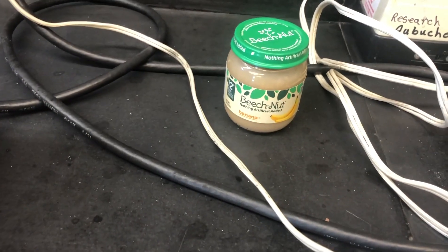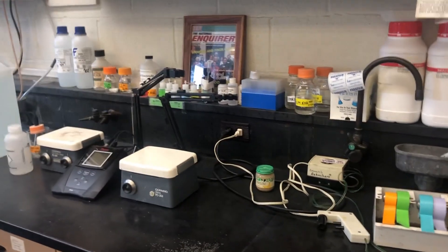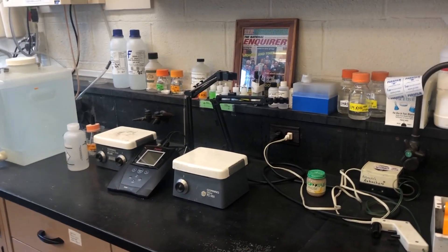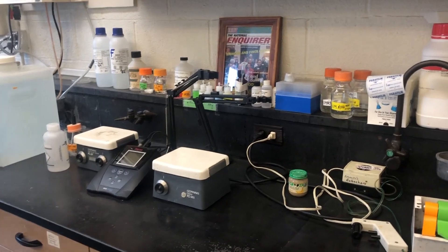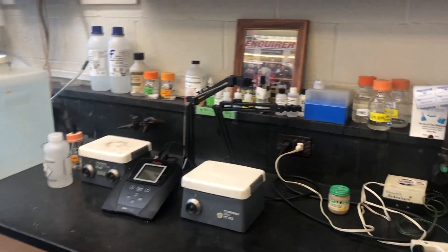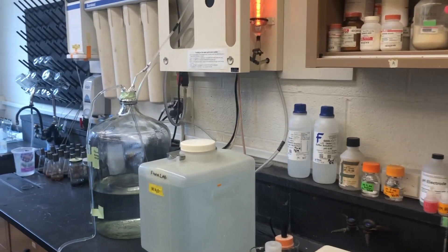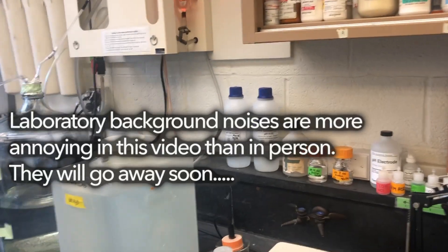This is a Beechnut baby food, and I add this to one of my orchid media. What I'm going to do is try to figure out what components of the baby food contribute to really nice root growth in that orchid replate medium. I'll have a video discussing that coming up.